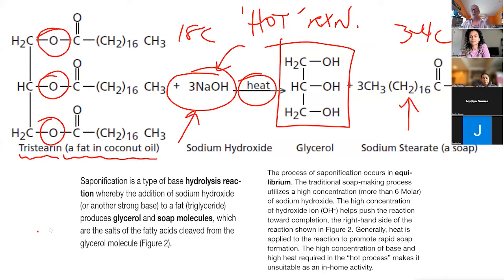And so this reaction goes really, really fast. What we're going to be doing is the cold reaction, at room temperature and with much lower concentrations of sodium hydroxide.